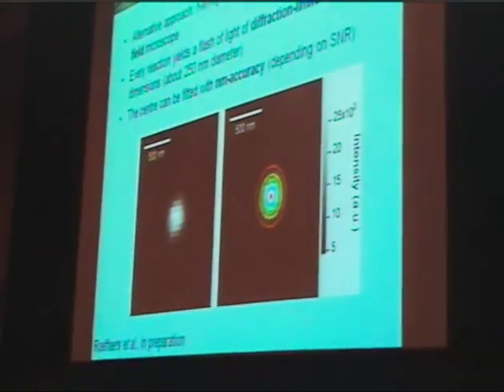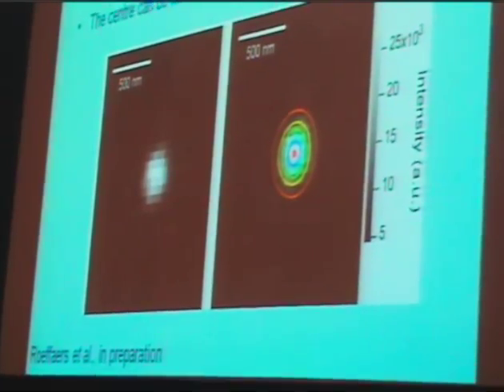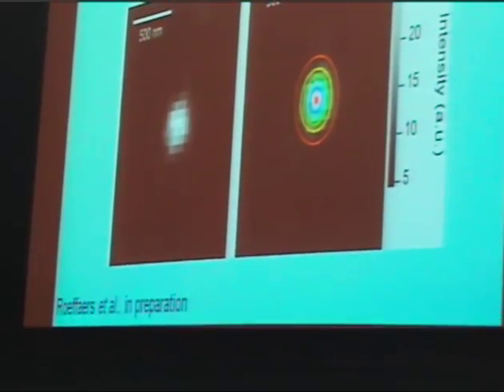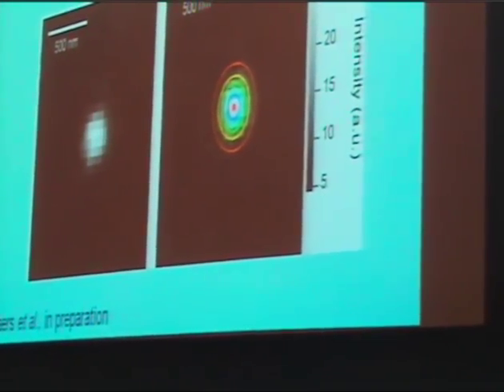So you see the fluorescent spot from one single emitter, and because there are no other emitters in the neighborhood, it's well isolated, so you can really determine the center of mass of the emissive spot. And the center of mass of the emission corresponds to the exact location of your emitter. So by fitting this intensity profile, for instance, with the 2D Gaussian function, you can localize the emitter with an extremely high resolution down to the nanometer regime.